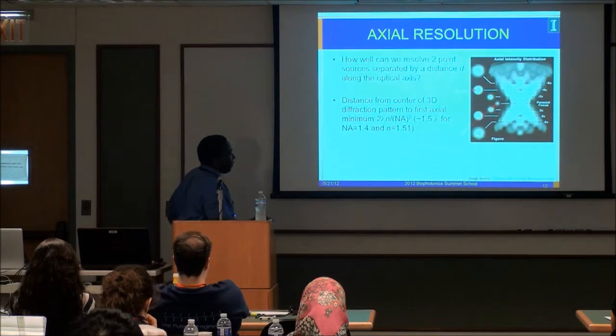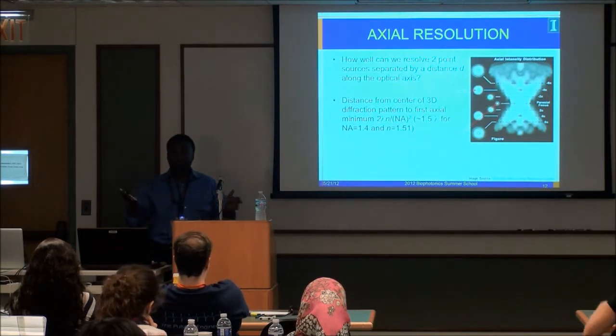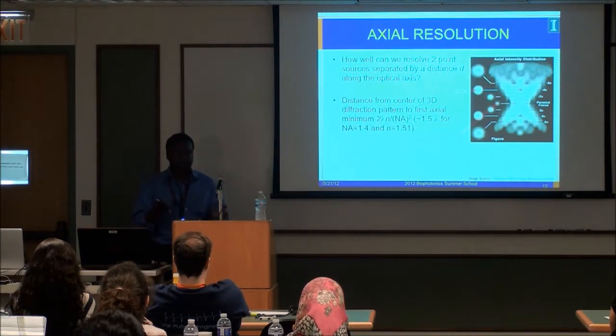Here, these two arrows point to the distance. Here we have the paraxial focus. Paraxial focus just means that all of these rays coming in, which are approximately paraxial, all focus within the same region. They don't all fall on the same point. They're all within the same region, okay?